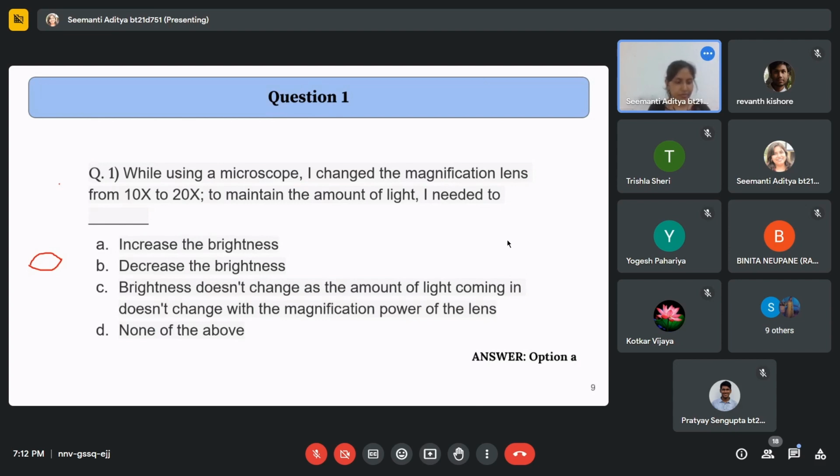Physical, what do you mean by physical aperture? Or whether x20 is smaller because of shorter f, in the sense of focal length or something you're saying. Focal length.